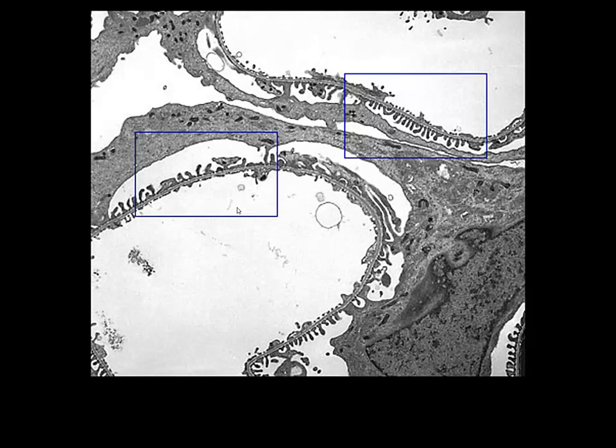Here we are in the kidney, the glomerulus of a kidney, and this is where we have our fenestrated endothelium. You might remember this from phys class. These are the pedicels of our podocytes. On the outside, there's our basement membrane. You can see the three layers even in this little mag, the two lamina lucidas and the lamina densa in between. And then here we have the fenestrated endothelium of our glomerular capillaries.